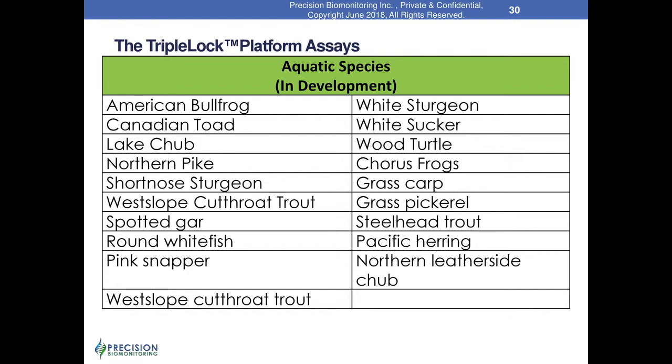Thank you very much, Steve. Now, a question from Lauren Lawrence from Mi'kmaq Conservation Group in Nova Scotia. So the question is, is there a possibility that a wood turtle primer based on Ontario populations would not hit on Nova Scotia populations? And if this is a possibility, how would you validate whether this would work or not? Steve. Okay, that's a very excellent question.